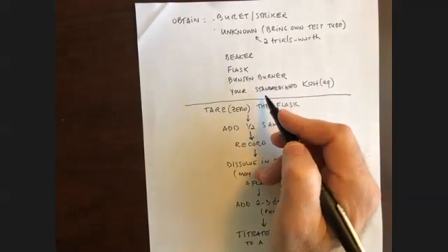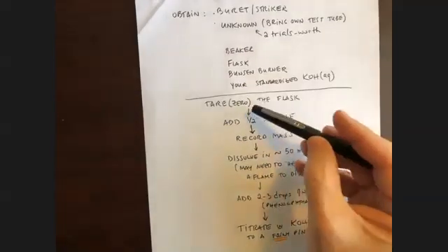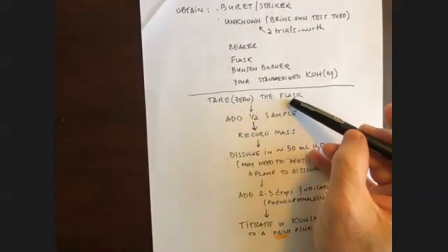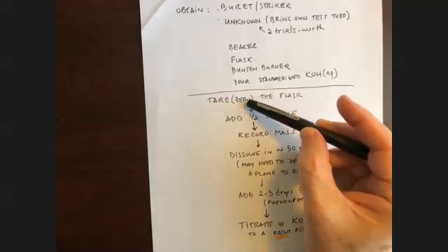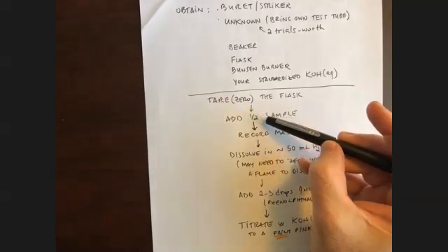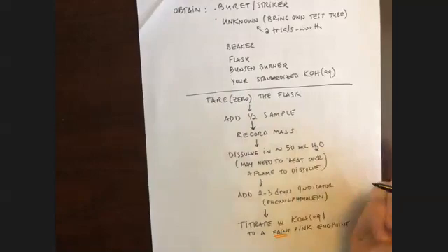And of course, you're going to be using your standardized KOH solution that you made and standardized in the previous experiment. Okay, we're going to start by taring the flask. That means you put it on the balance and you hit the 0 button. And then you're going to add about half of your sample. See, now what you have is you're directly recording the mass of sample that's inside your flask. Okay, you're going to record that mass.